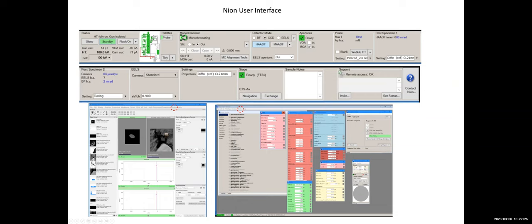If you look at this part, this is actually the main software interface of the AS2 control monitor. You can see there are a few menus, like file. When you click file, there will show up some options, and edit, data, setting, hardware, window, and help. I drew a dashed circle here telling you that you need to frequently click window, because sometimes you can click the X to close those windows. How do you get those windows back? You need to click window and select those windows. So I want to briefly introduce you to those windows, which you will frequently use.